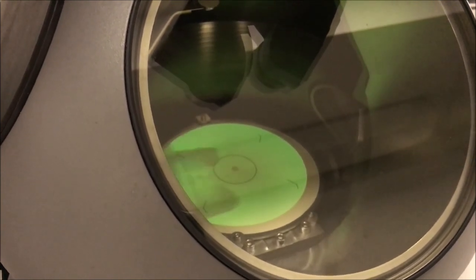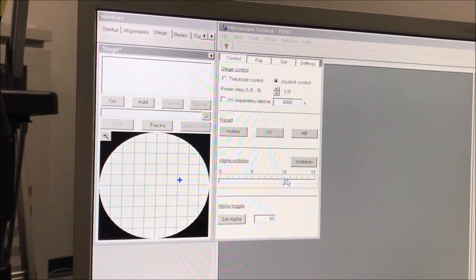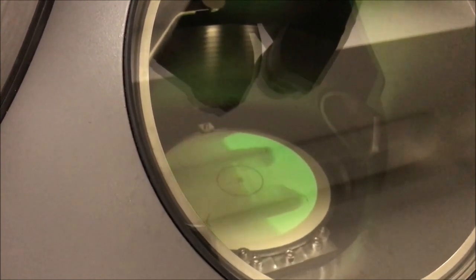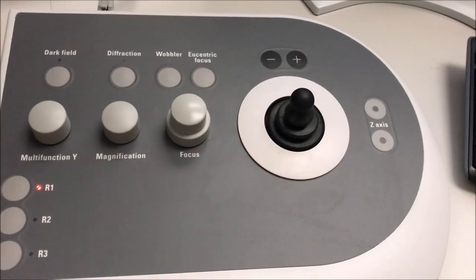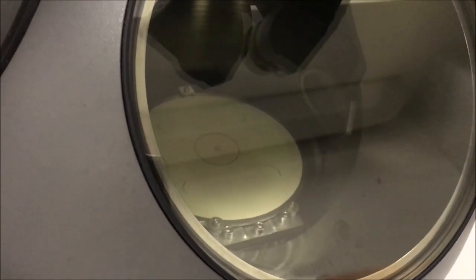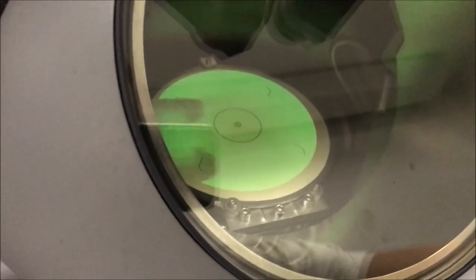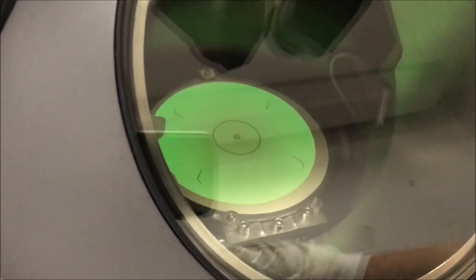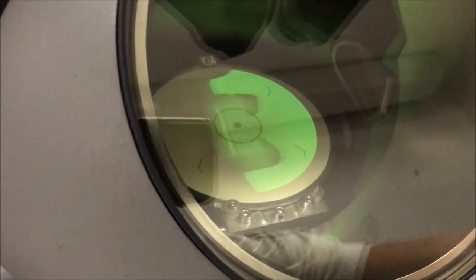You can change the sensitivity of the alpha wobbler — turning it off and changing from 15 to 10 degrees, which is plus or minus. Usually 10 degrees works pretty well. You can see the sample is staying in the field of view but the image is moving, so the sample is not at eucentric height. What you do now is go to your right-hand panel, use your z-axis buttons, and adjust z until the image of the specimen doesn't move while the alpha tilt is wobbled. If the shifting gets larger you're going farther from eucentric height; if it gets smaller you're getting closer. Adjust the z-axis until the shifting is minimized.